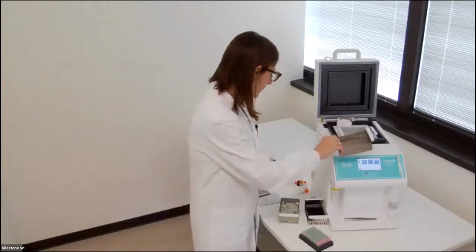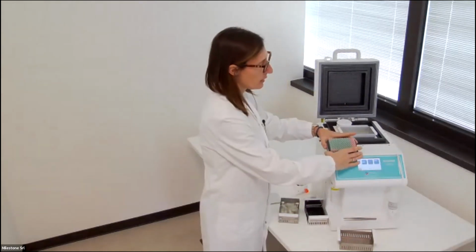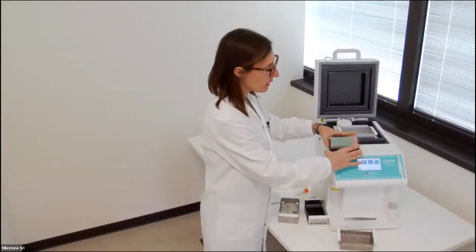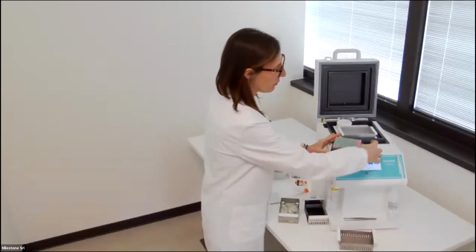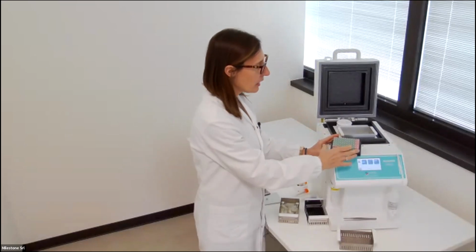In case of plate, it is possible to use plates for 96 vials, for 48 vials, so the one that you prefer. The important thing is that the plate is a standard plate, so with this dimension, about 10 centimeters by 8 centimeters. In our manual, you can find the perfect size. I don't remember now, but they are the standard plates normally used in all the labs.